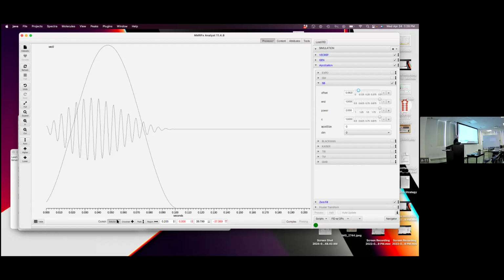And there are some theoretical benefits of having your apodization window matched to the shape of the actual data you're acquiring. So for this experiment, it looks silly to get rid of all this stuff at the beginning, but for a different experiment, it might be the appropriate thing to choose. So there's actual science involved, and part of it is looking at what looks good with your actual data.